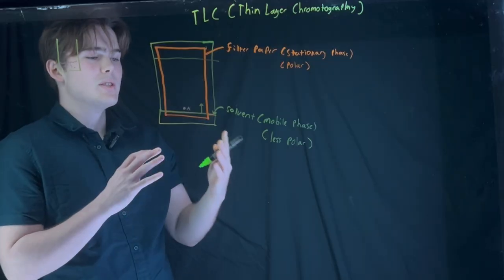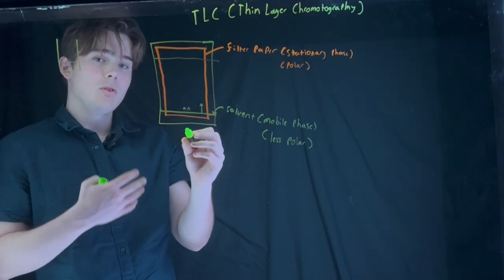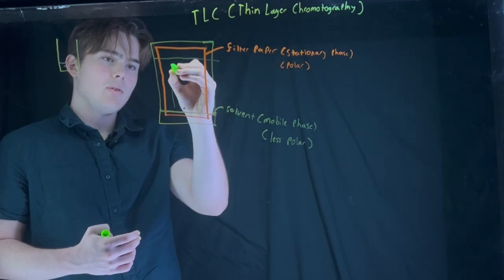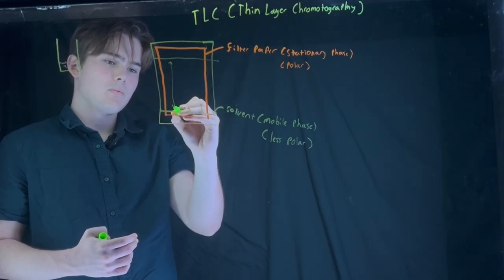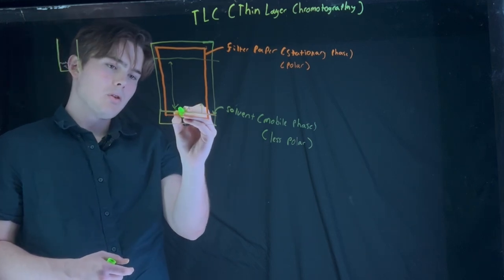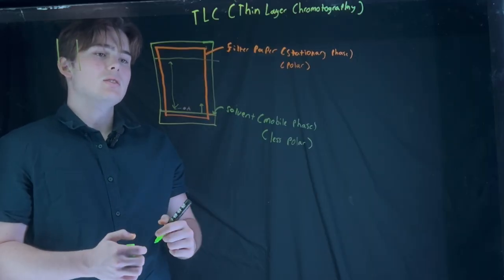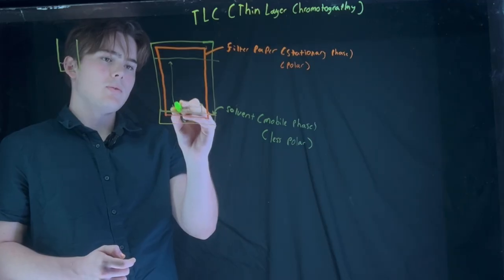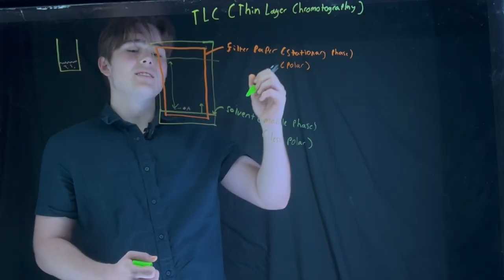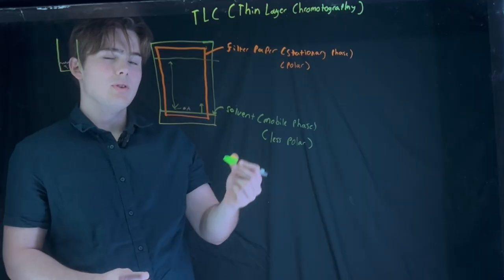Now we measure the distance that that solvent moves. We measure it from the point of our unknown amino acid. So it's going to be represented by this distance here. From that point of our unknown amino acid, it's going to move from there to there. Whatever that distance is, that distance represents the mobile phase, or the distance the solvent has moved.